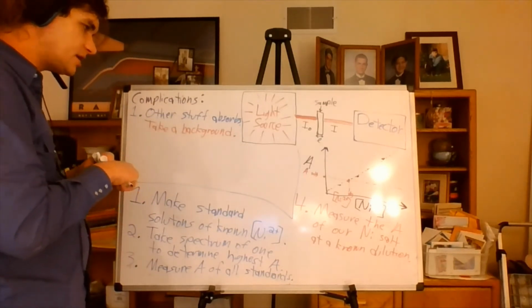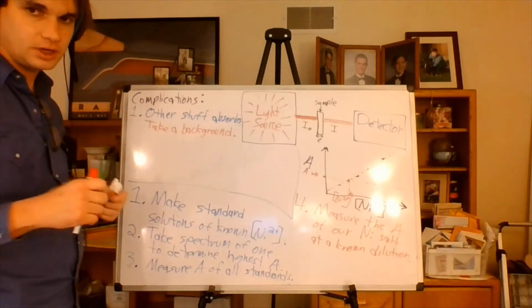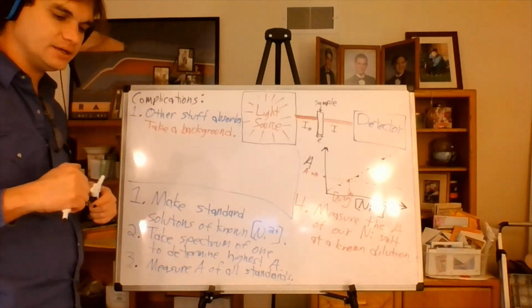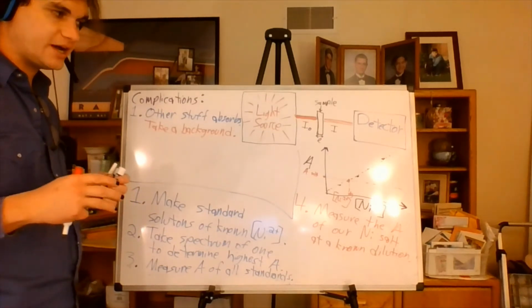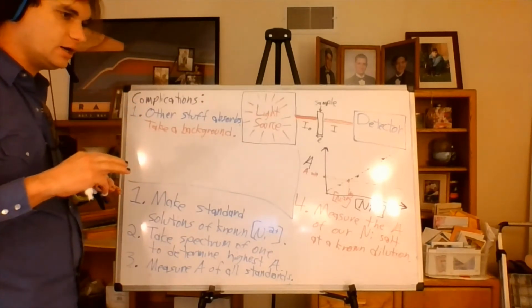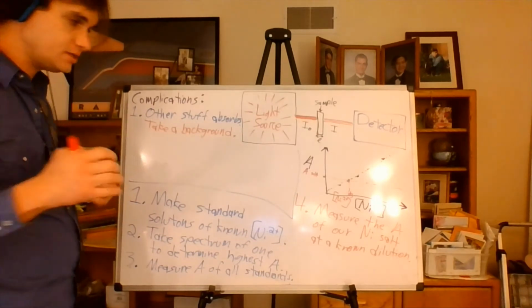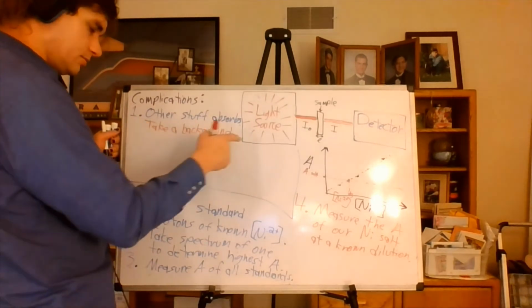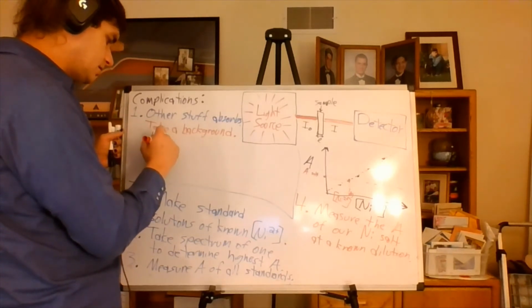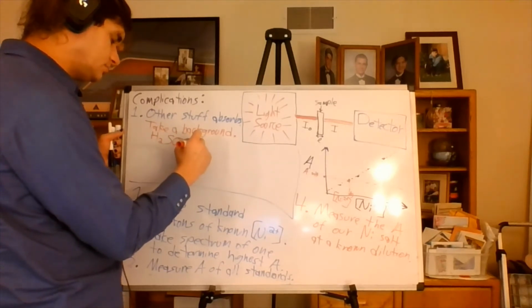Now, because our nickel salt uses sulfate as a counterion, we are going to be dissolving it in sulfuric acid so that the only ions that are there are also sulfate, which means that the background will be taken with a sulfuric acid solution.